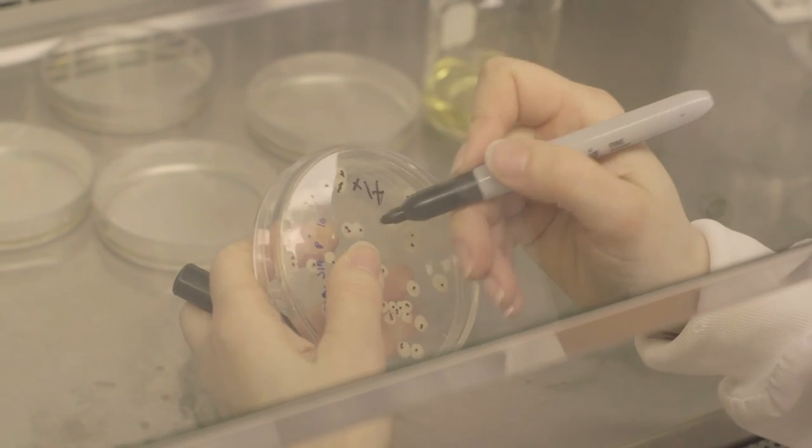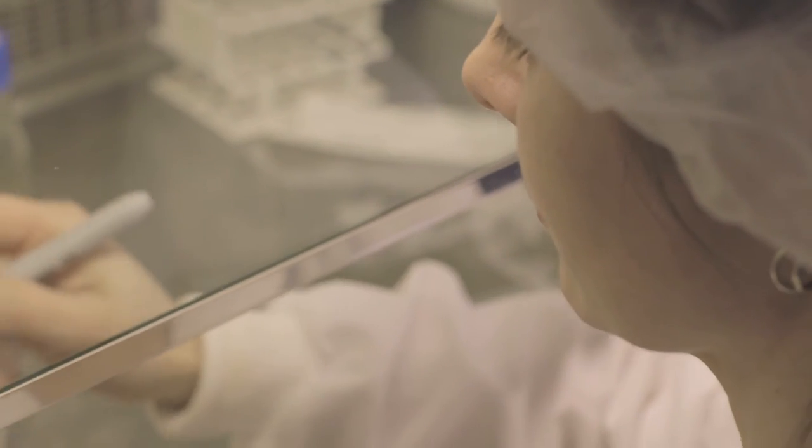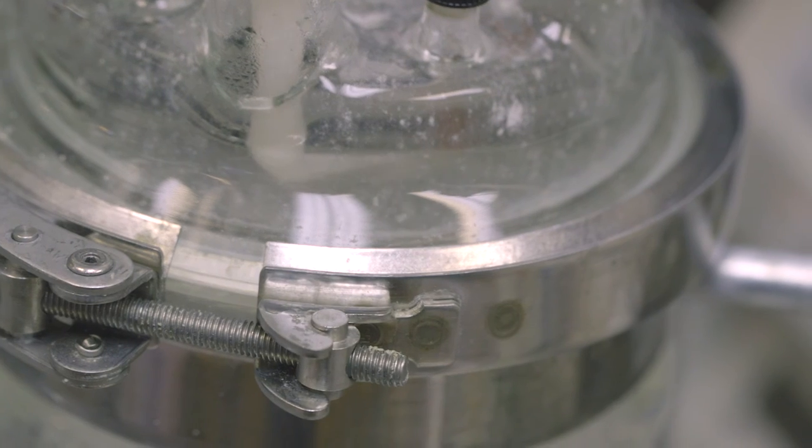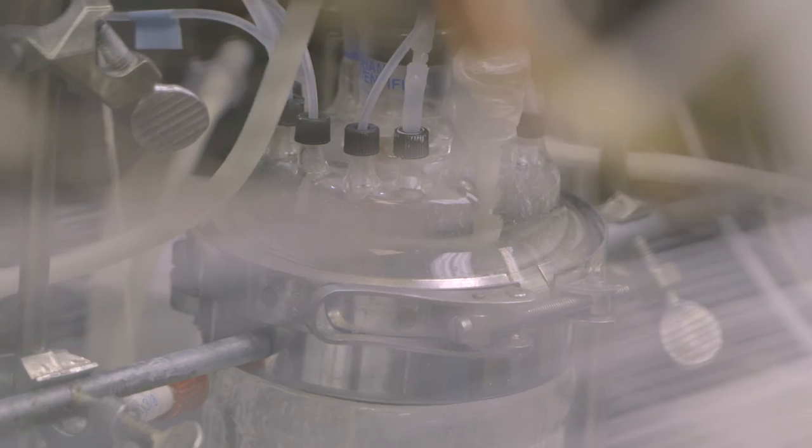Before its creation, no one could say for sure that probiotics survived the conditions present in the stomach. The artificial stomach has confirmed a host of positive responses. This technology opens the door to a wide range of possibilities, making functional foods increasingly accessible to consumers.